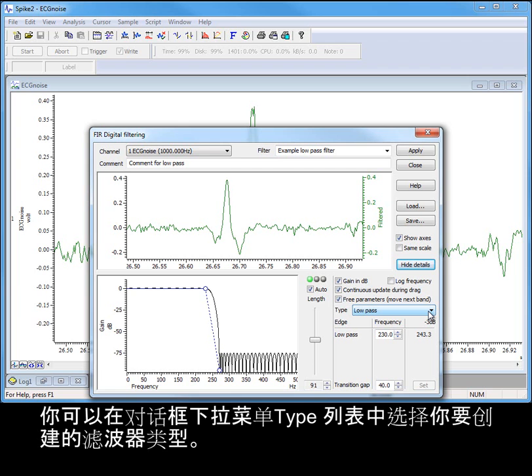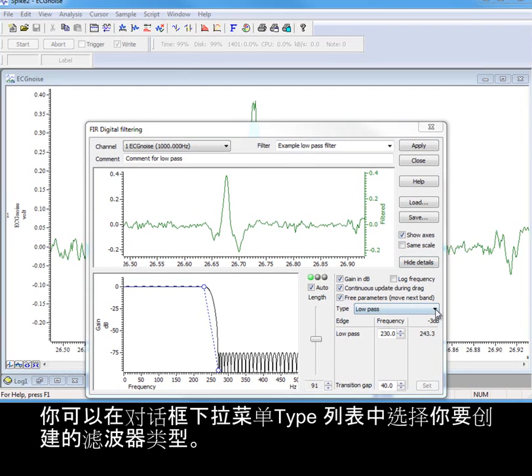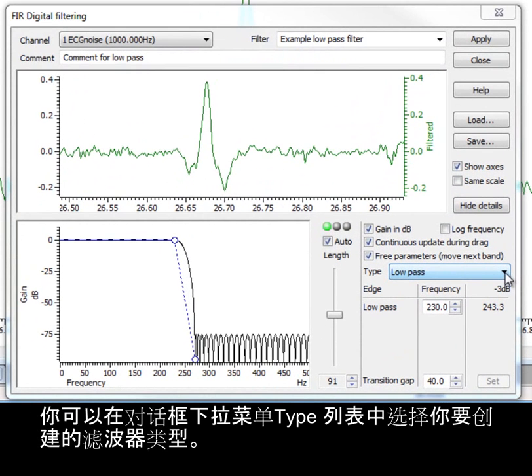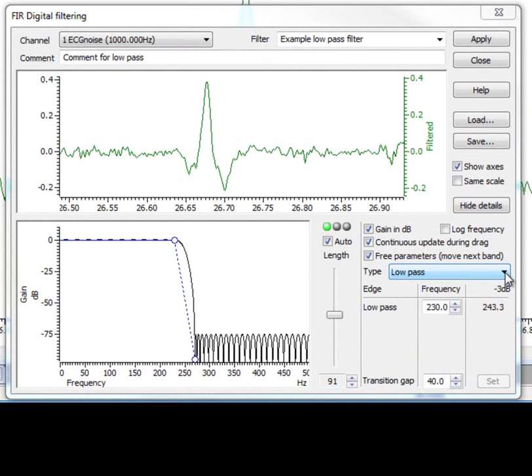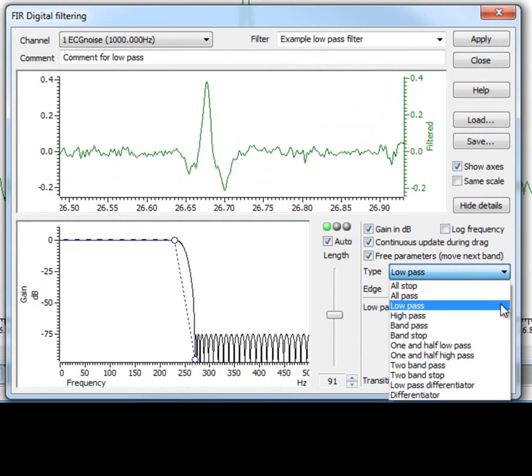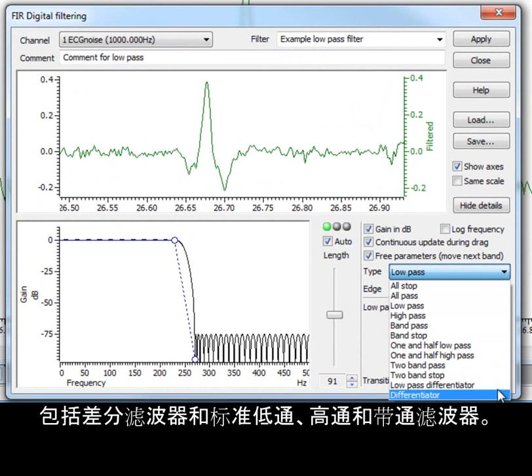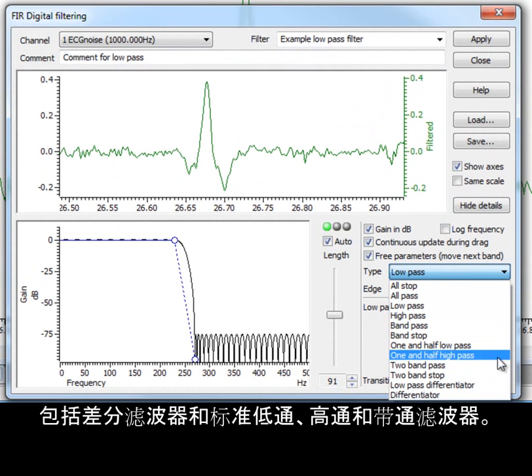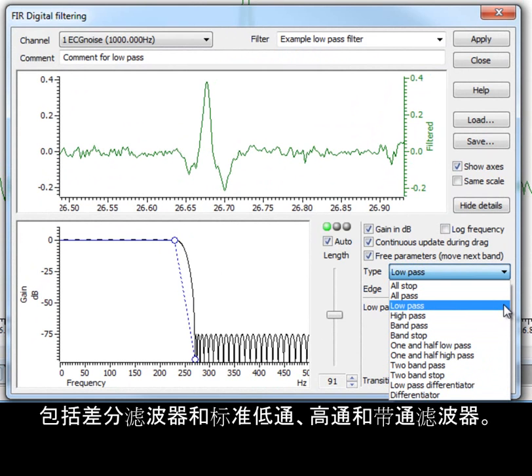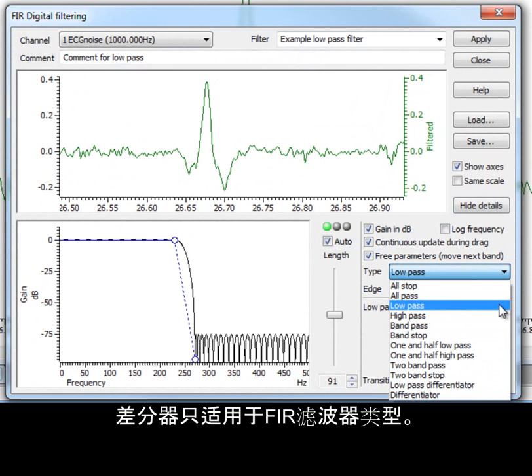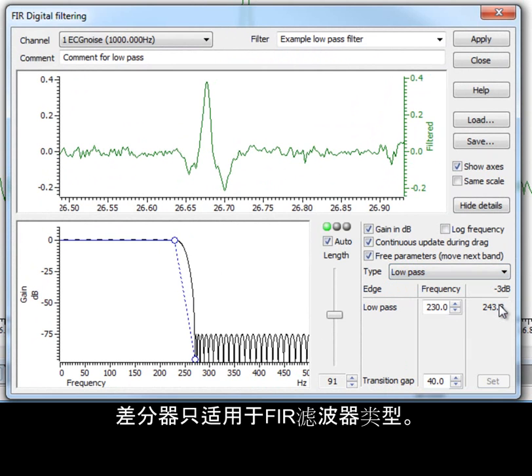The style of filter you want to create is selected from the drop-down type list in the dialog. This includes differentiator filters, as well as the standard low and high pass and bandpass filters. Differentiators are only made available for FIR filter types.